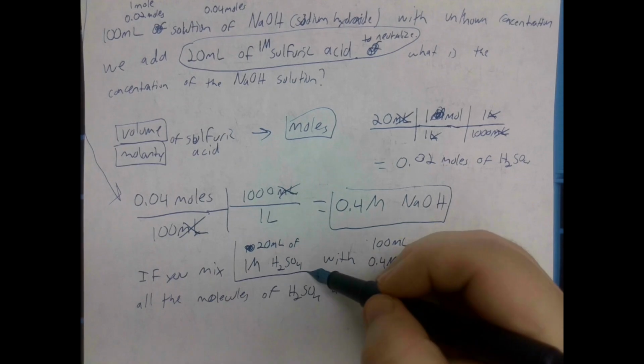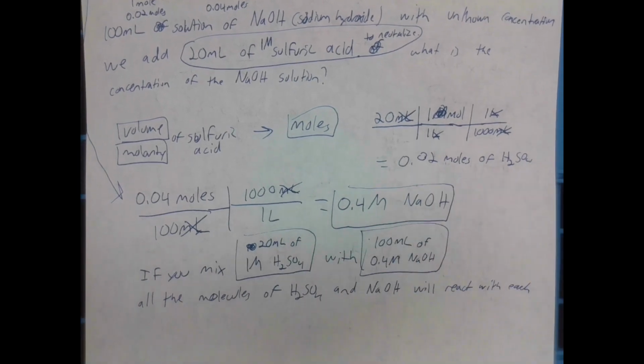It's only whenever you use this combination do you have every single molecule react.